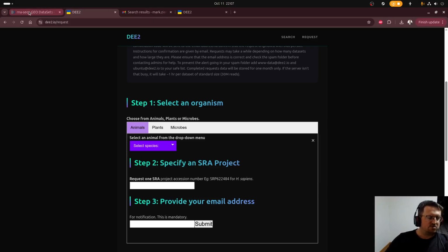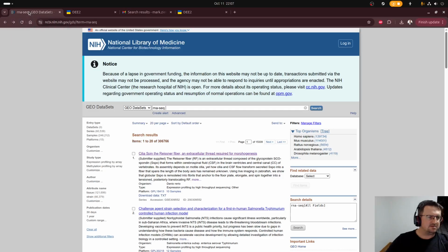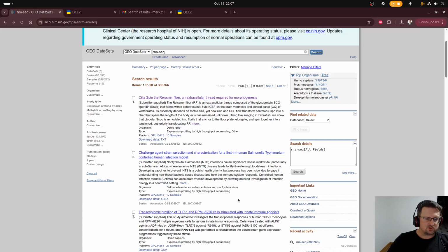I will start you off from the NCBI GEO website. If you've read an interesting publication and there's a GEO series number, you can plug that into the GEO search bar and you'll get hopefully just the one hit for that study. Or you can just scroll through GEO and find things that are of interest to you.